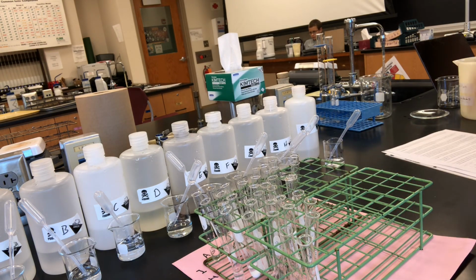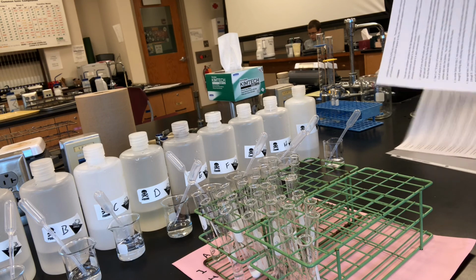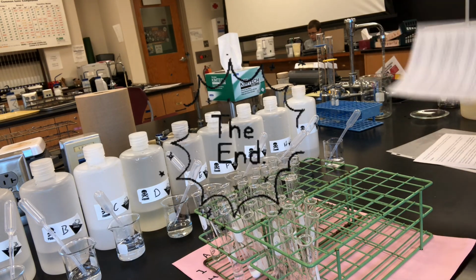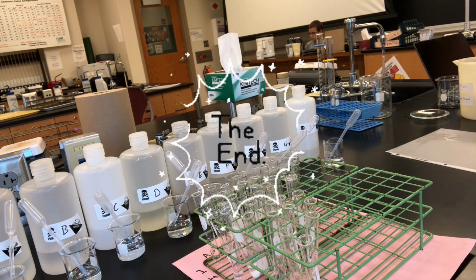I'm going to go ahead and perform my waste disposal according to the instructions and put the proper test tubes into their proper waste disposal places.